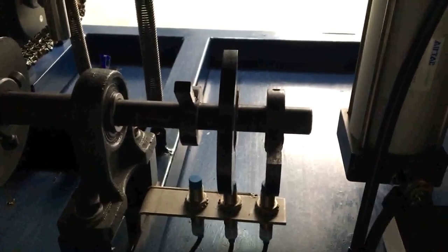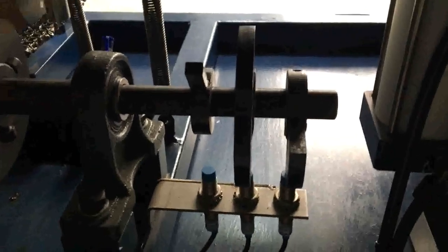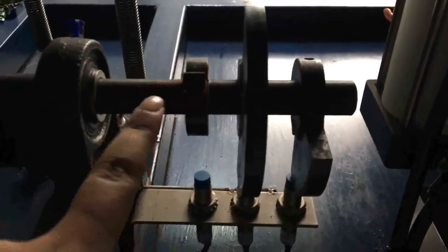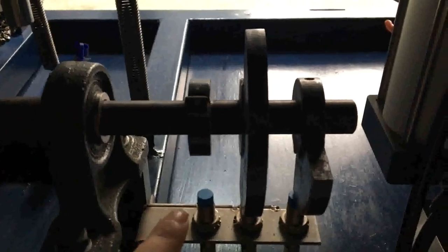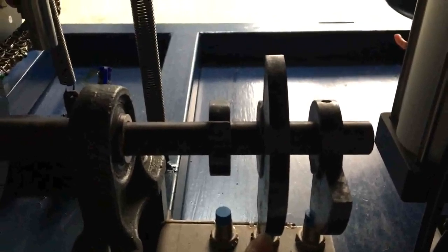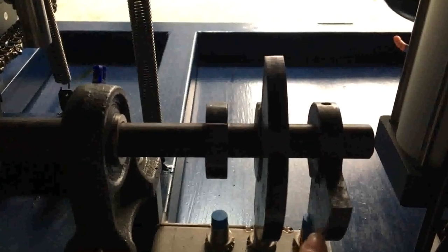We start to do the signal cam adjustment. There are three signal cams. The first one controls when filling starts. The second one controls when clamping and cutting tail starts. The third one controls when tube loading starts.